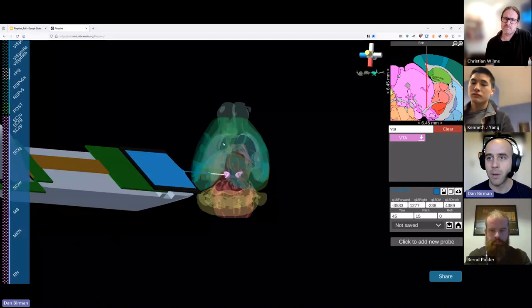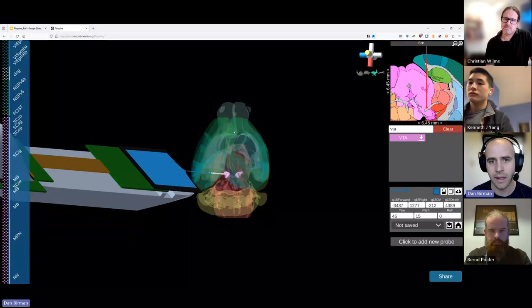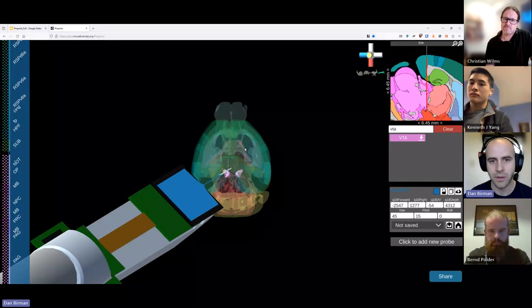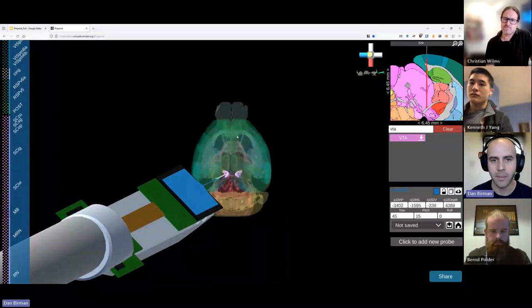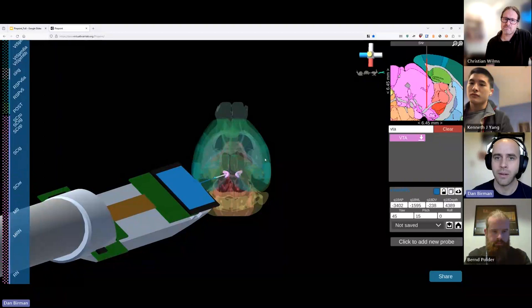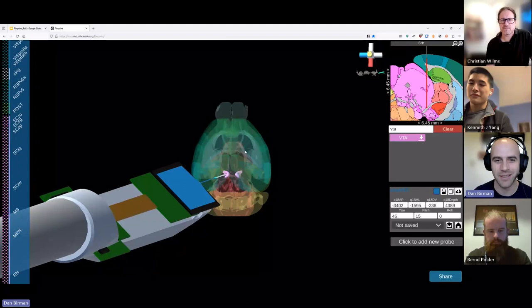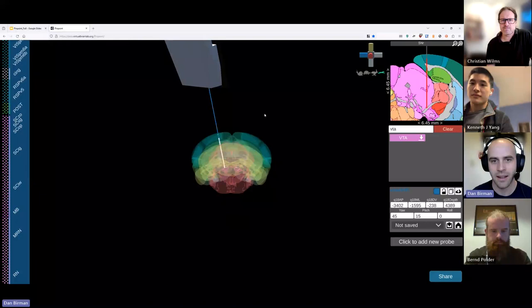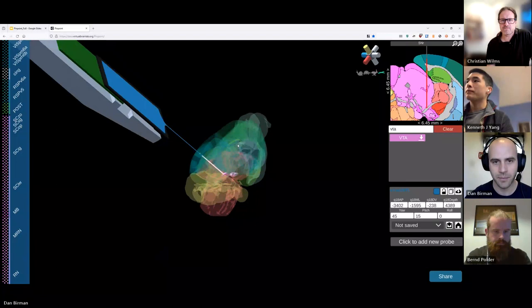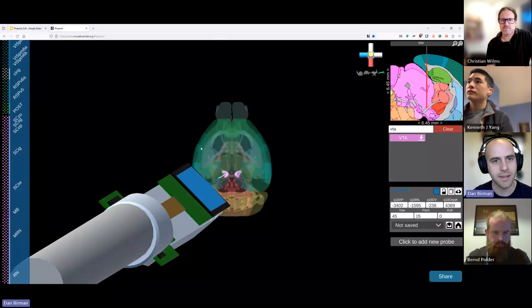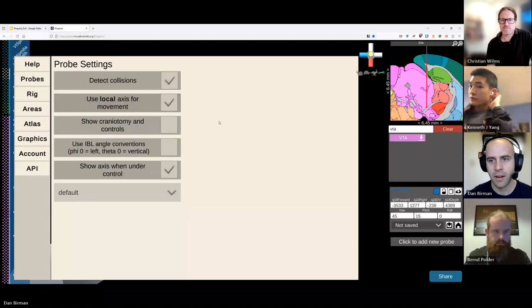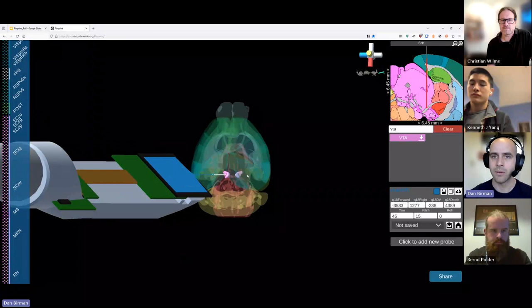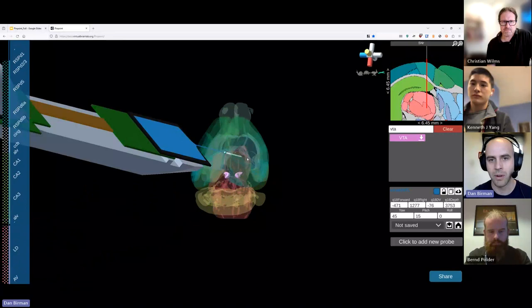If you want to make small adjustments, you can use the keyboard keys. W and S are the anterior-posterior keys. A and D move you along the ML axis — the left-right axis. Q and E move you along the DV axis. Z and X move you along the probe's depth axis. There's also a setting called 'use local axis for movement' under the probes tab — this switches these axes to be the probe's own axis, which is useful for strangely rotated insertions.